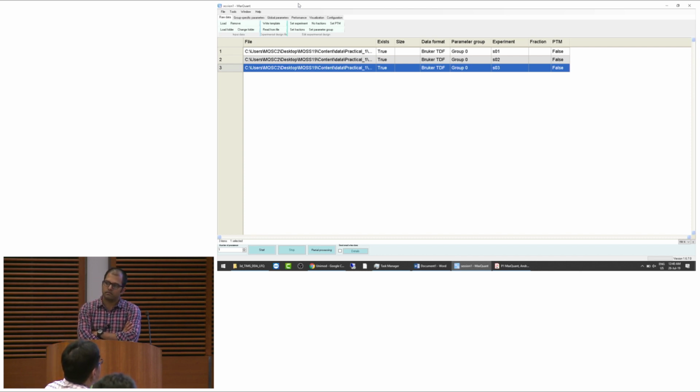So the alignment of retention time is actually not looking at all at the experimental design and at the fractions. It's independent of this, determining the alignment order. The alignment order is determined by some dendrogram. So it's doing some clustering on the samples, forgetting completely about experimental design and fractions, and then it's using this clustering to determine the order. That means it just takes the 2 most similar samples in your MaxQuant project and aligns them first. It doesn't ask if these are the same fractions or not. So because of that, it would do everything right, basically.